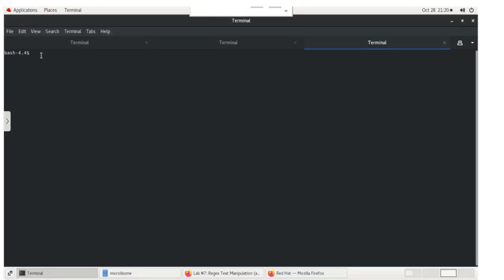So once you have your raw data from somewhere, if you have this on your hard drive, then it's fine. If you don't have it, if you have the link, you can download it by using the wget command.